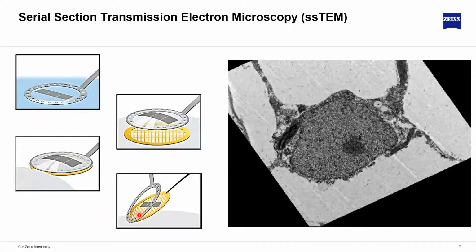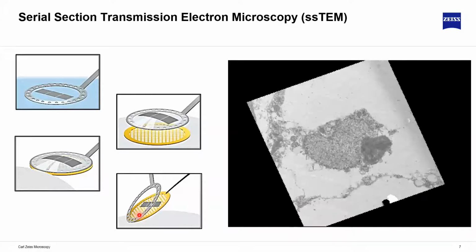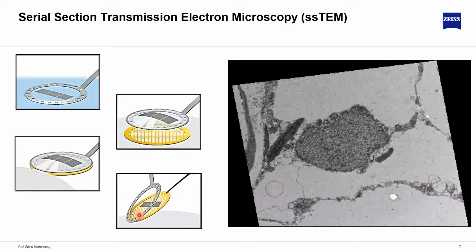But that's not always the case. And I hope I'm pointing a little bit to the extreme of what ssTEM can look like. So this is one of the examples. And while we're running through the stack of images, you will see the challenges that arise.